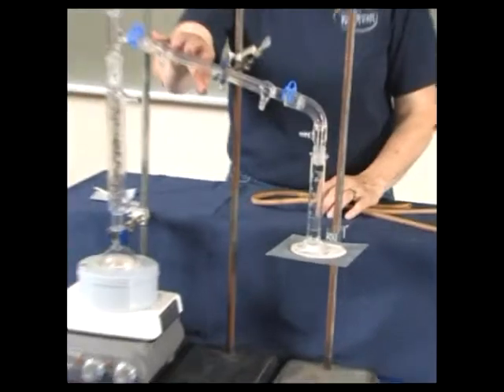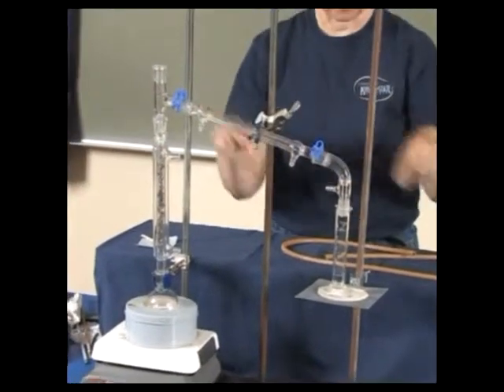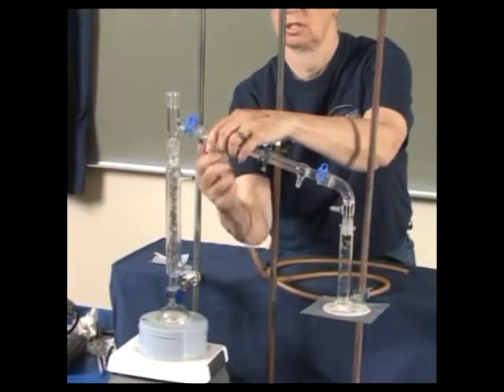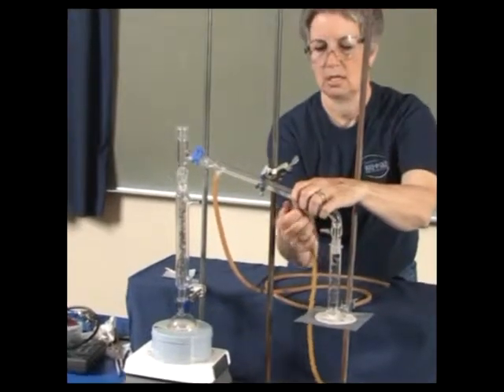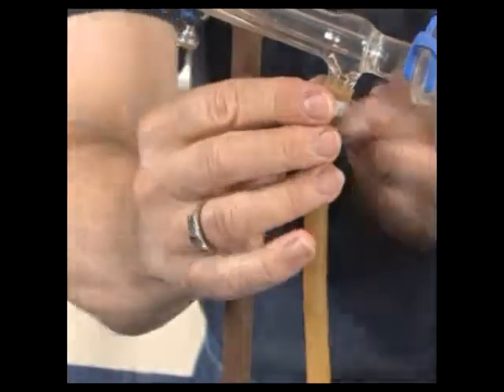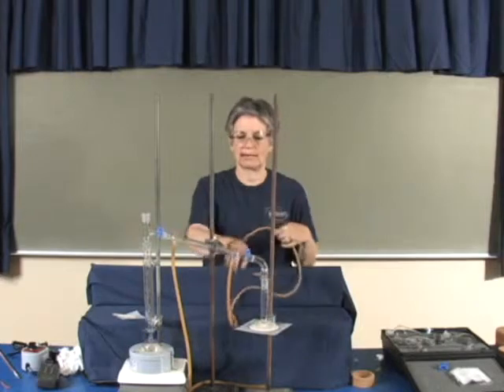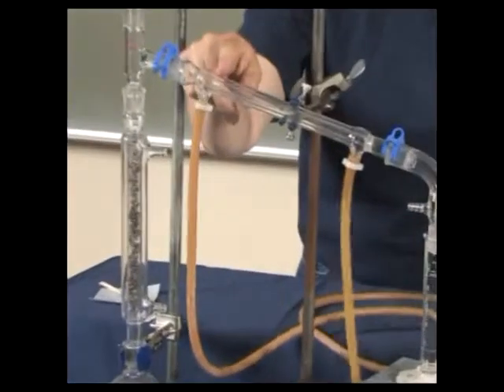This is a water-cooled condenser. The sample will run down the center tube with water around the jacket. So the water hoses must be attached, and secured with little condenser clips so the hoses don't flip off. The water should go in the bottom and out the top so that the jacket entirely fills.